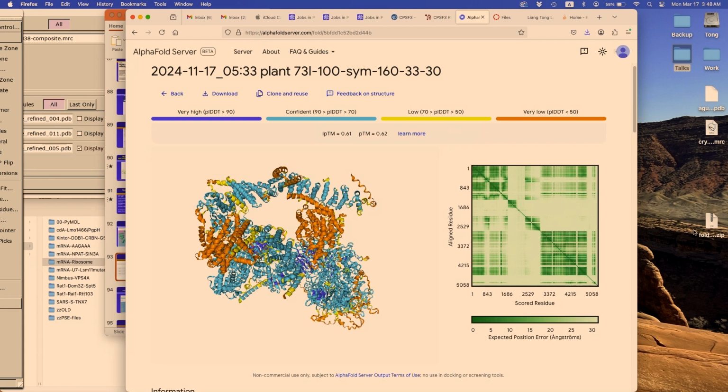Quite often we see these so-called IDRs, intrinsically disordered regions. They are disordered on their own, but when they are in a protein-protein complex, they could become stabilized. We have quite a few examples we found by chance. We didn't even know that they were ordered until we did the structure and said, oh, where did that come from? It came from a disordered loop that was basically ignored, but turned out to be the part that's important for the interaction.